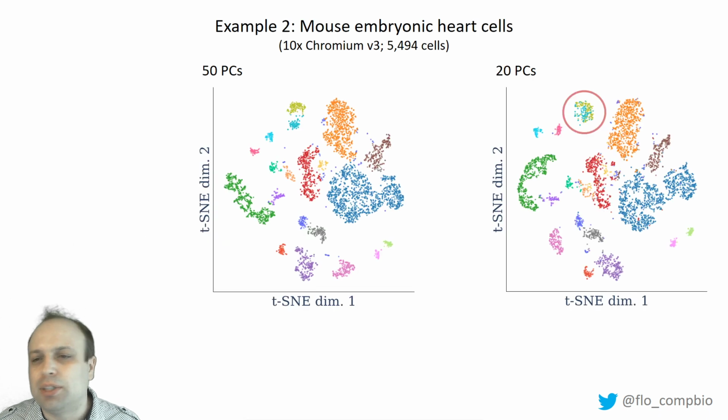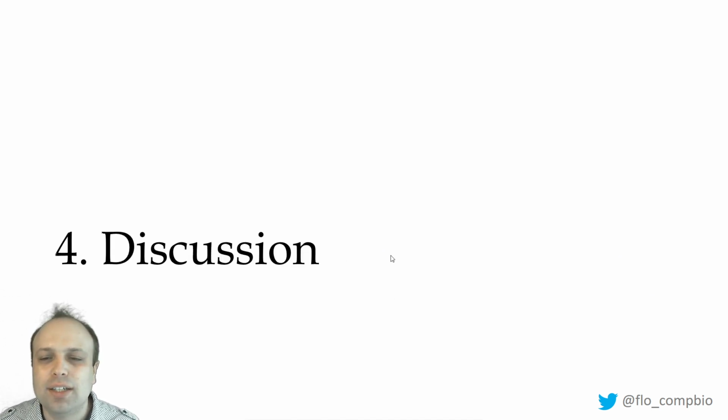And so, by the way, I actually don't know what all these clusters are, but there's a big cluster, maybe this one here, that's T cells, and I just find that fascinating that there's so many T cells in this hard tissue. So I just wanted to mention that.